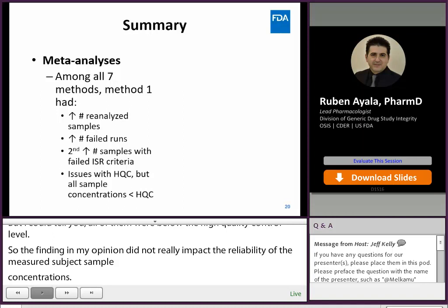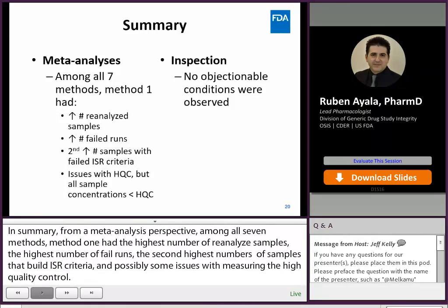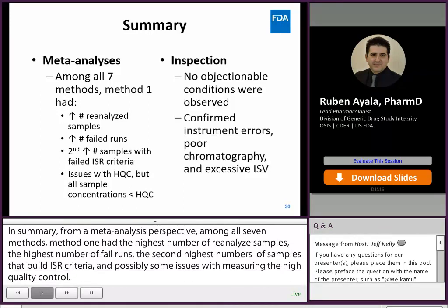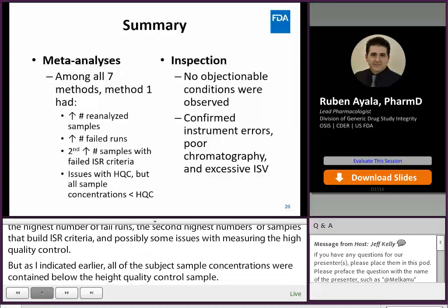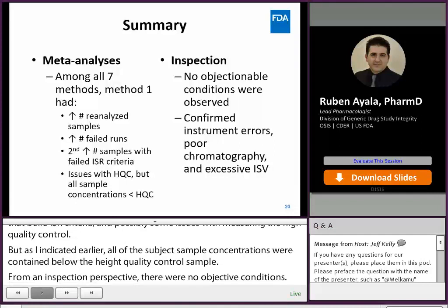In summary, from a meta-analysis perspective among all seven methods, method one had the highest number of reanalyzed samples, the highest number of failed runs, the second highest number of samples which failed ISR criteria, and possibly some issues measuring high quality control samples. From an inspection perspective, there were no objectionable conditions. I was able to confirm instrument errors, poor chromatography, and excessive internal standard response variability — these three issues led to the high number of reanalyzed samples and failed runs.